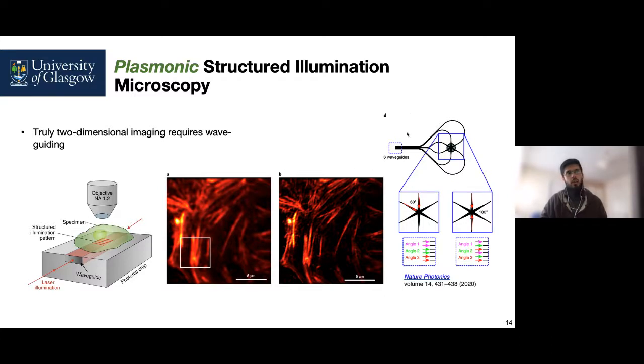they proposed a set of waveguides in which the illumination beams have been split by an encoder. So based on this encoding and based on the way we excite the sample stage through this multi-stage waveguide, we would have rotated illumination patterns, which in turn will give us resolution capabilities in 2 as well as 3 dimensions.